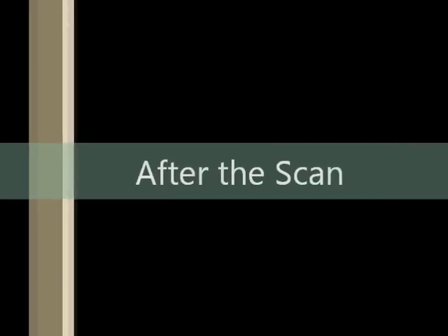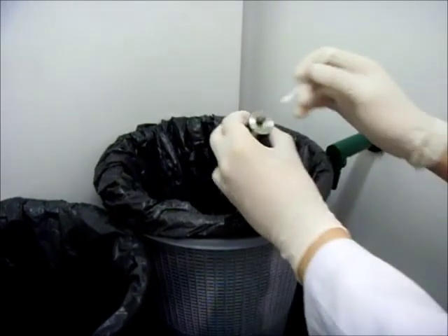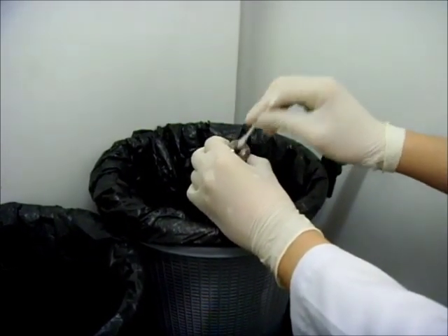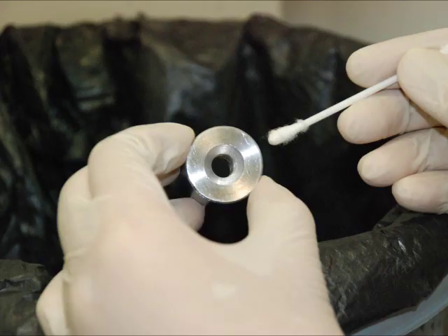After the scan, you have to do some housekeeping. You have to do the next step inside the fume hood. Use a clean cotton bud and poke through the aperture of the sample assembly. Scratch off any remnants on the inner walls. This is how you evacuate your sample disk into the trash bin. It is all good now and you can leave everything ready for the next person who is going to use this.